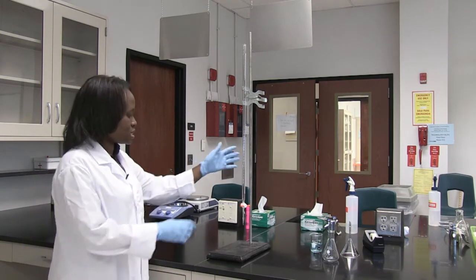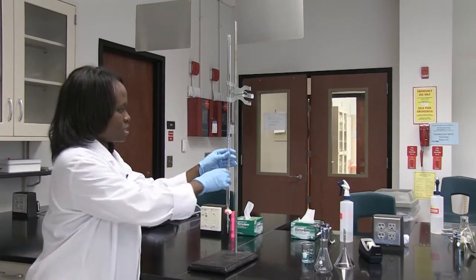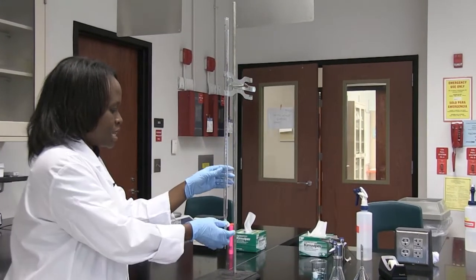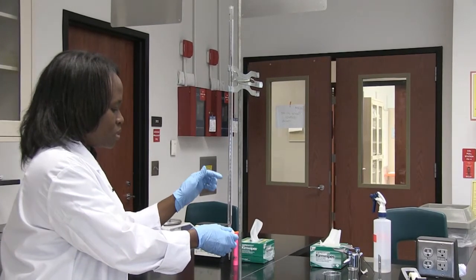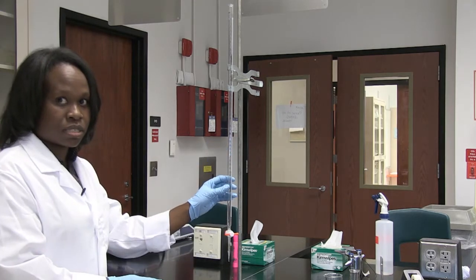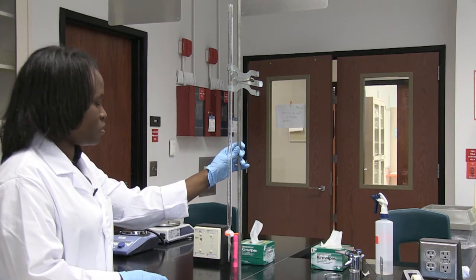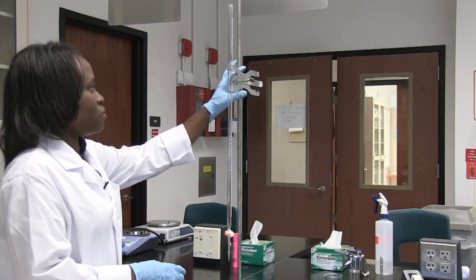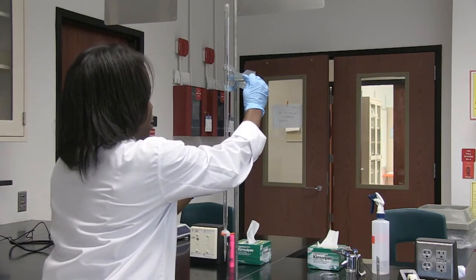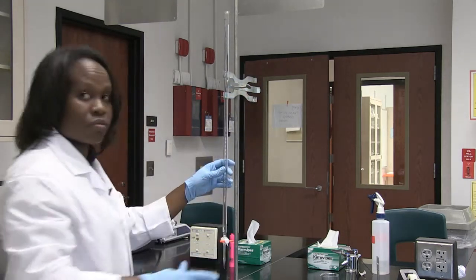So this is the whole setup of the burette apparatus. This particular cylindrical glass is called a burette. It has a stop cork that will allow liquid to flow out of the cylindrical glass itself. It is held in place by a burette stand, which has a burette clamp on it, which allows the burette itself to be adjusted up or down, depending on your comfort level.